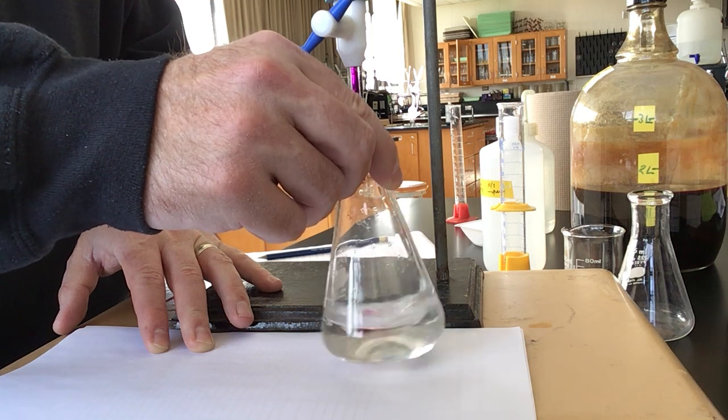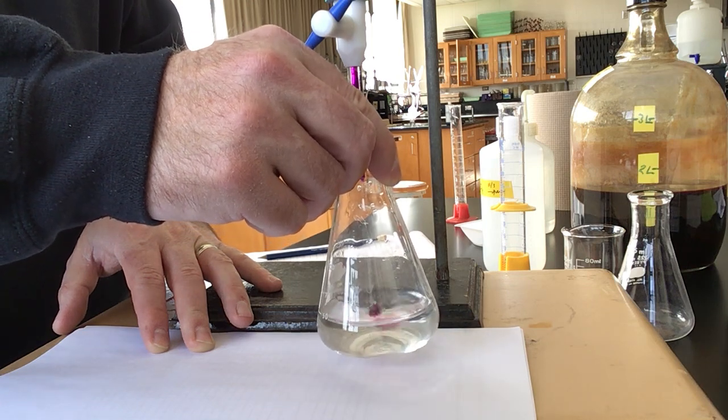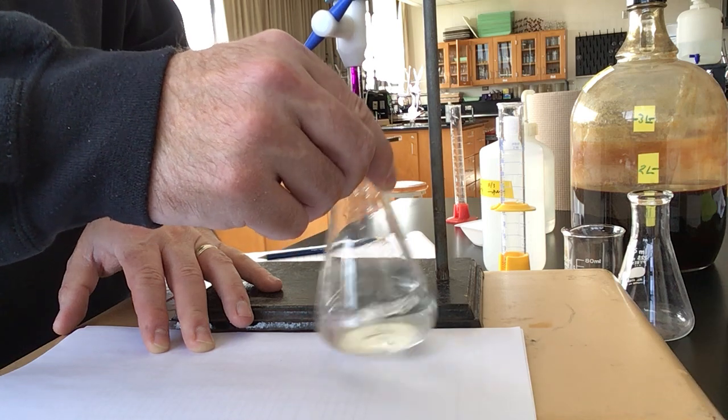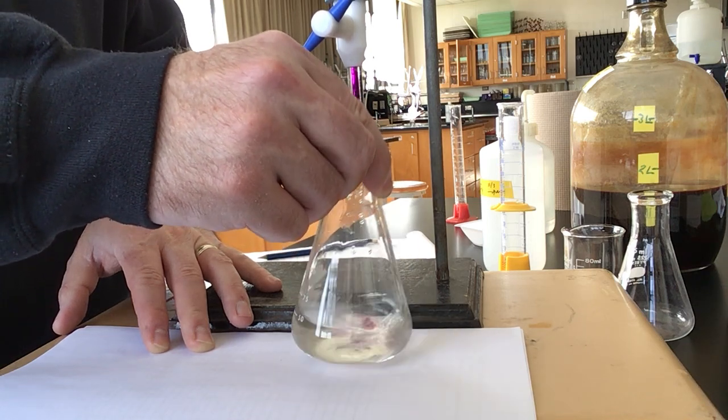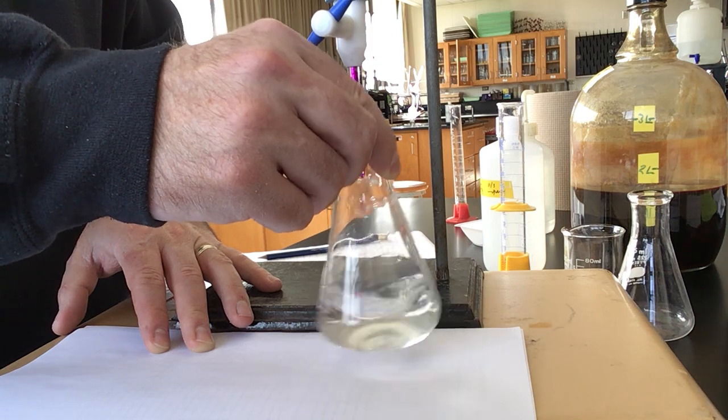So I've got this going at a couple of drips per second. You can kind of see that the potassium permanganate lingers for a little bit, and then as we mix it, it goes away.